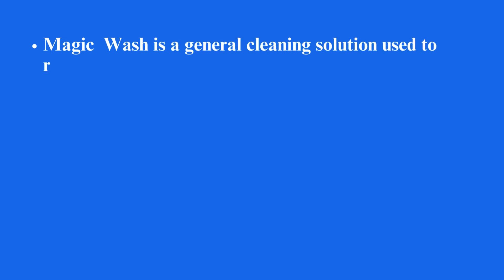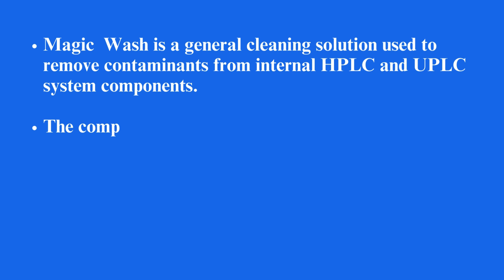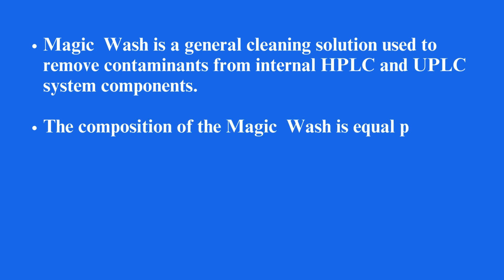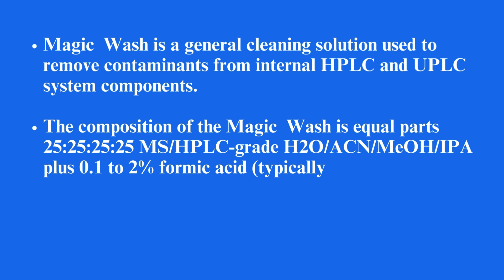Magic wash is a general cleaning solution used to remove contaminants from internal HPLC and UPLC system components. The composition of the magic wash is equal parts 25/25/25/25 of MS-HPLC grade H₂O, ACN, MeOH, and IPA, plus 0.1–2% formic acid, typically.